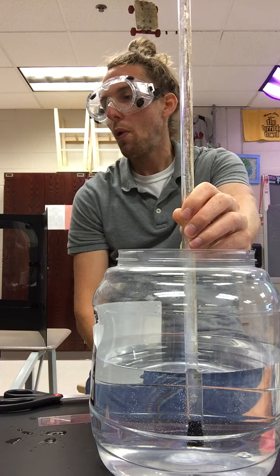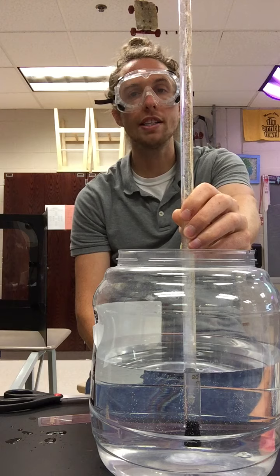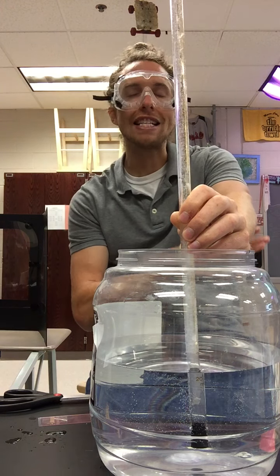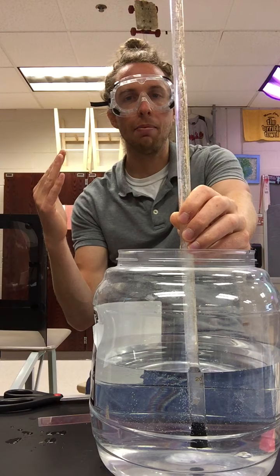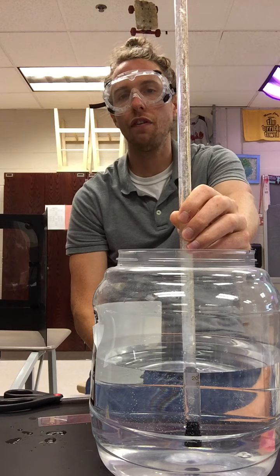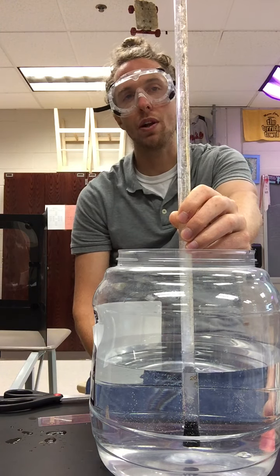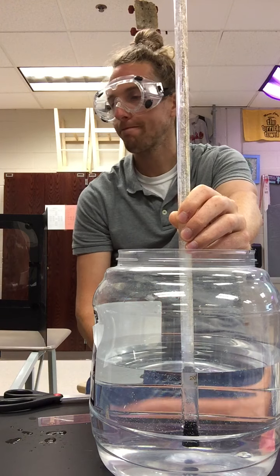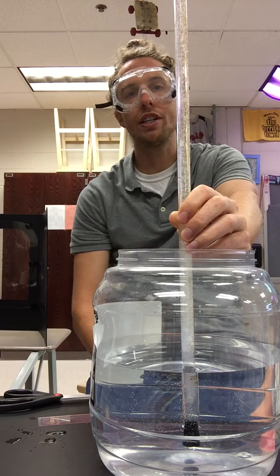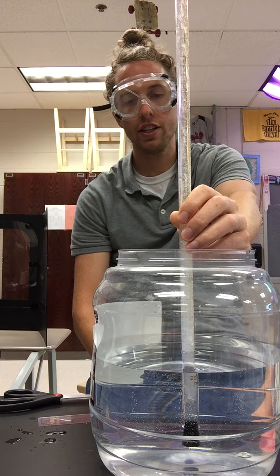earlier. So we have an amount of magnesium that we're using. It's 1.41 centimeters of magnesium. The mass of an entire meter of magnesium on your data table, if we had an entire meter, it would weigh 2.04 grams. Again, we're not using an entire meter. We're using 1.41 centimeters, but you can figure out the mass. I can tell you that the temperature of the water we're using is 20.0 degrees Celsius. So we measured that together, 20.0 degrees Celsius.